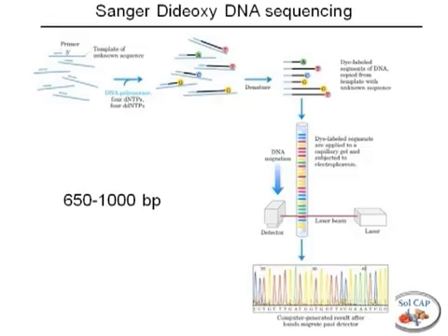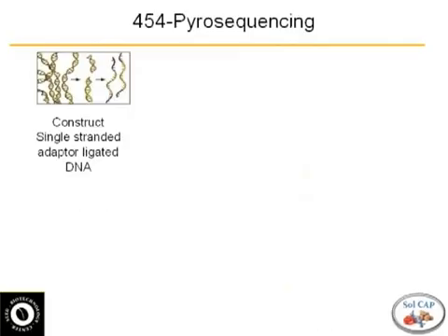So that's how the human genome was done. That's how rice was done, Arabidopsis, kind of the first things that were sequenced. Tomato was done with a combination of all these technologies I'm going to talk about. This first one is quite expensive, labor intensive, and takes quite a while.